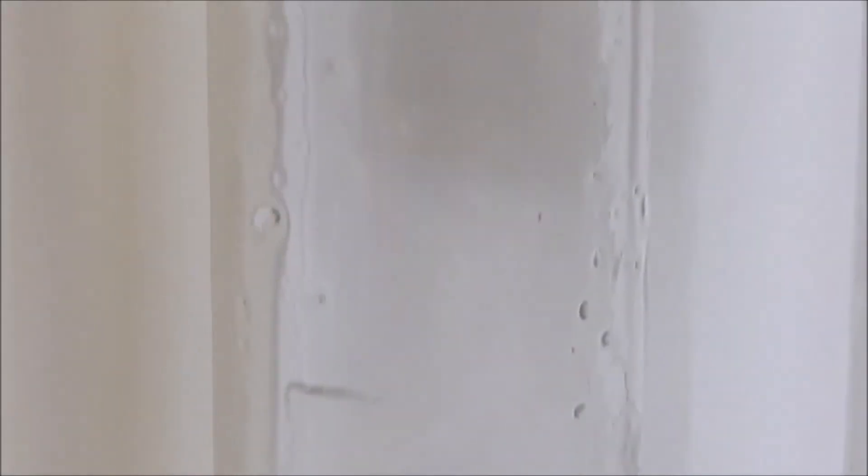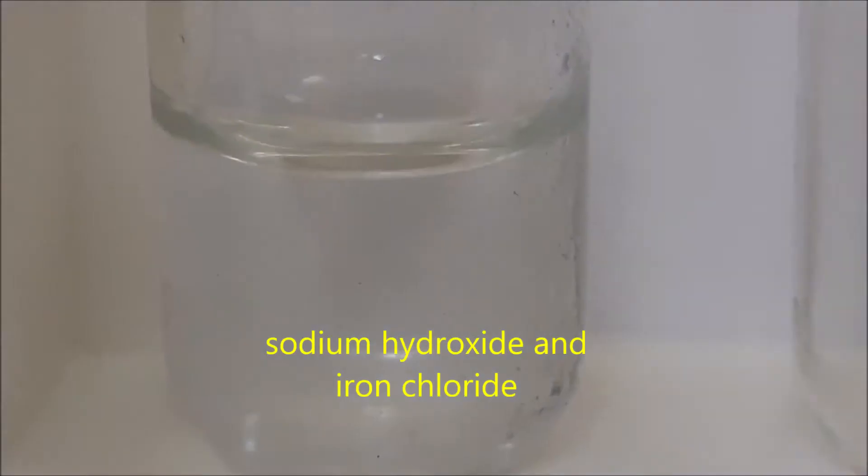For test tube number seven, we have sodium hydroxide and iron chloride.